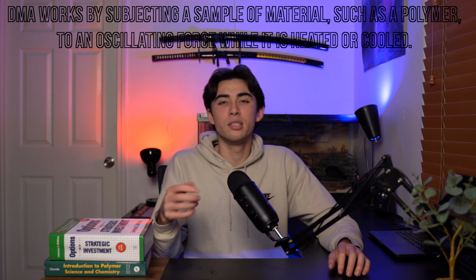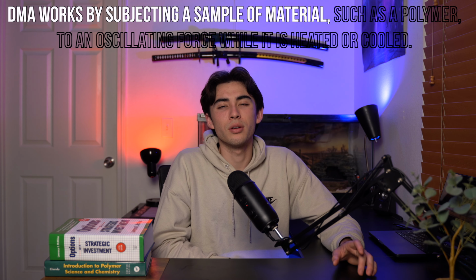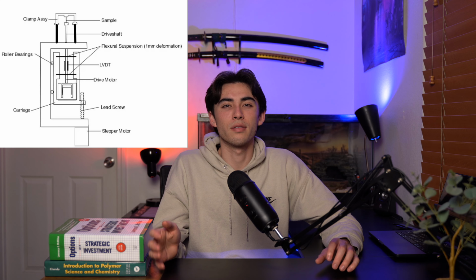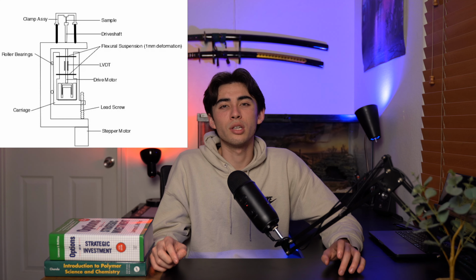So what is dynamic mechanical analysis and how does it work? DMA works by subjecting a sample of material such as a polymer to an oscillating force while it is heated or cooled. The sample's response to the applied force is measured, which provides information about the material's mechanical properties with respect to temperature. DMA is designed to apply a controlled stress or controlled strain to a polymer sample of known geometry and subject the sample to sinusoidal deformation. A force motor is used to generate a sinusoidal wave, which is transmitted to the sample via a drive shaft.